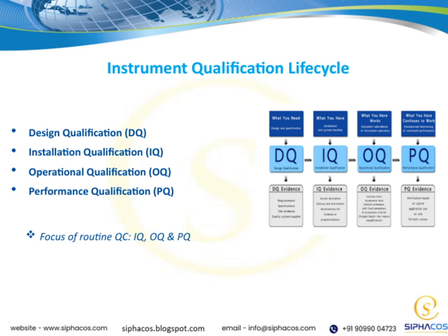Next is installation qualification, or IQ, which verifies that the equipment has been installed correctly according to the manufacturer's instructions and our requirements. Following that is operational qualification, or OQ, where we test the instrument to confirm it operates properly within specified parameters during normal use.